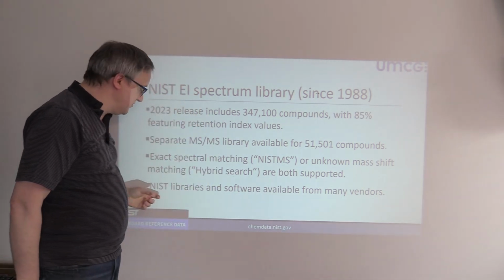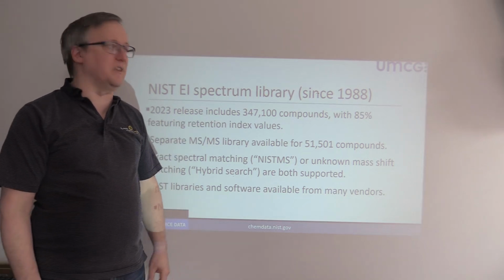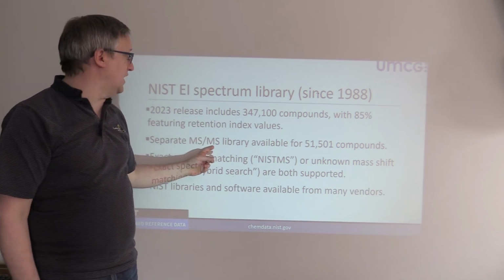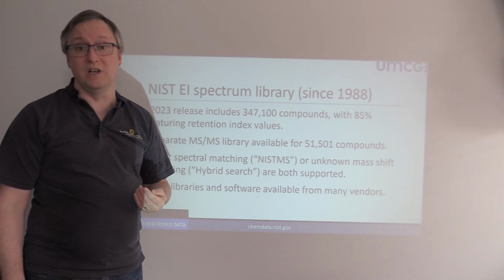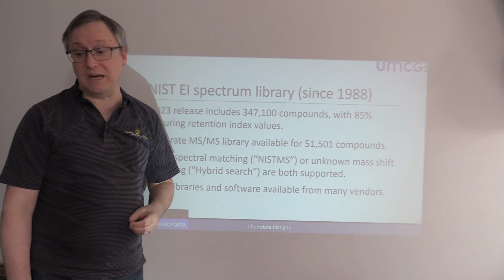Okay, so this library is available from lots of vendors worldwide. The spectral library for LC-MS is going to cost you maybe $600, and something like the whole electron impact library will probably be many times that. So it's a purchase that you make because you're going to make a serious investment in metabolomics.